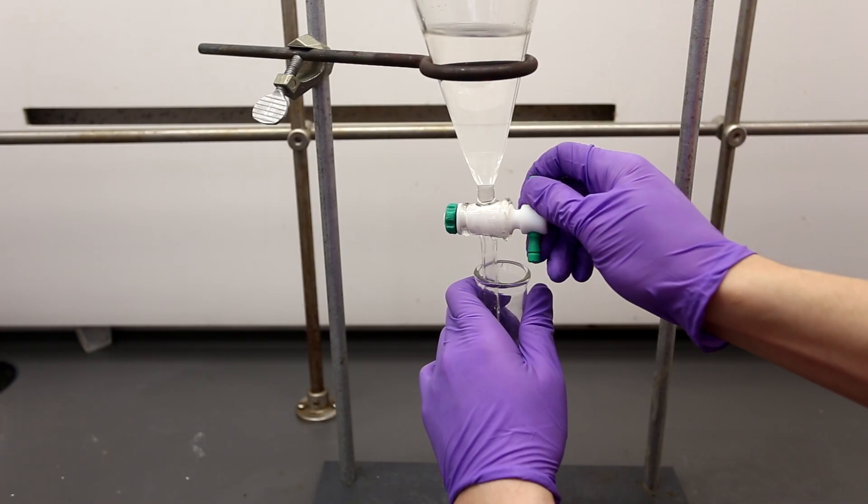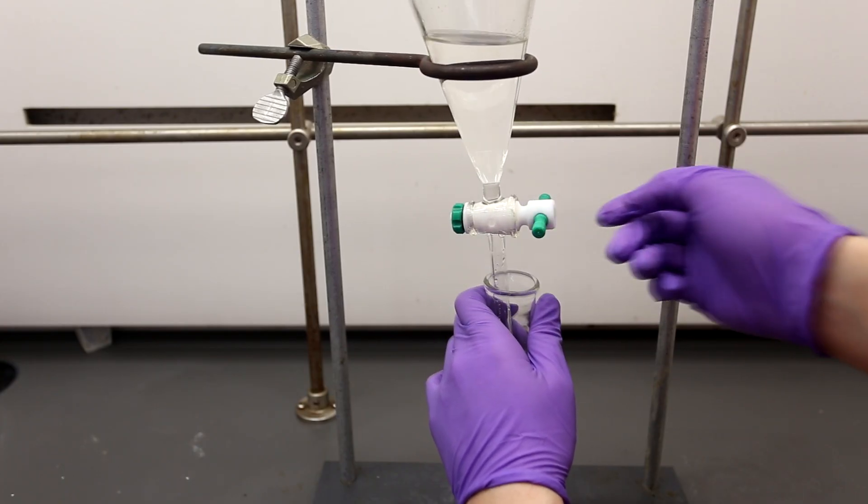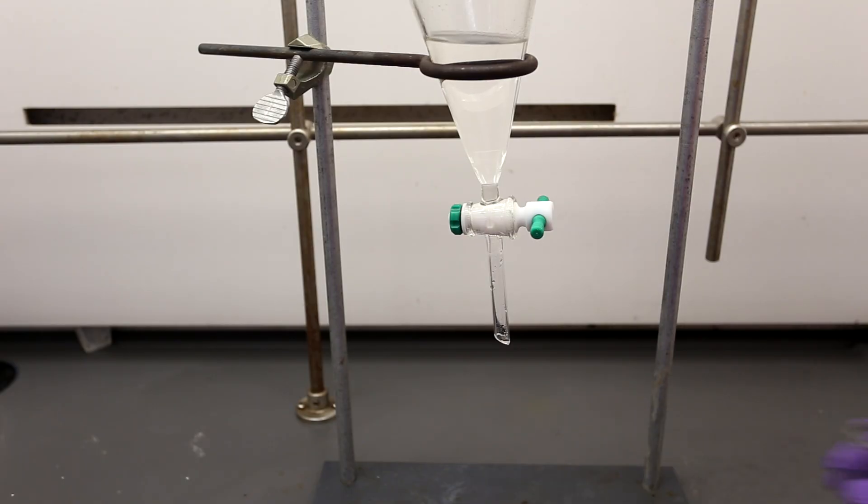Butyric acid is much more soluble in ether than in water, so most of the butyric acid should be in the ether layer, but some will be lost in the aqueous layer.